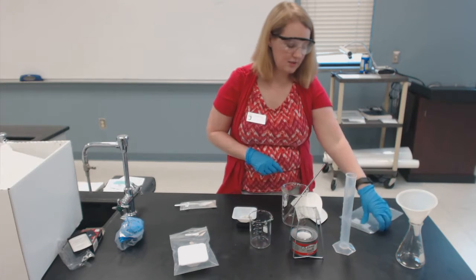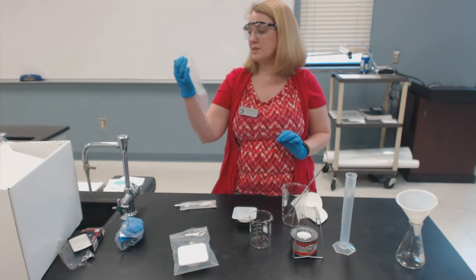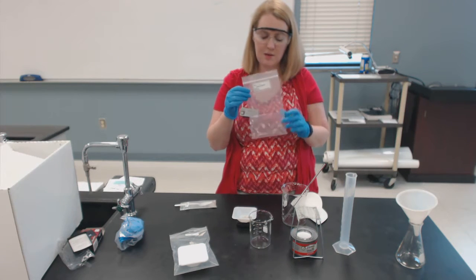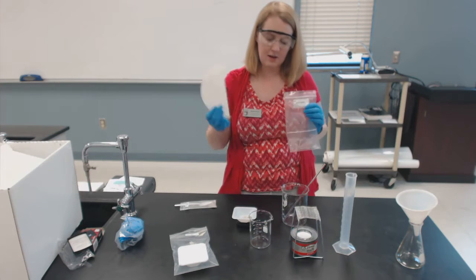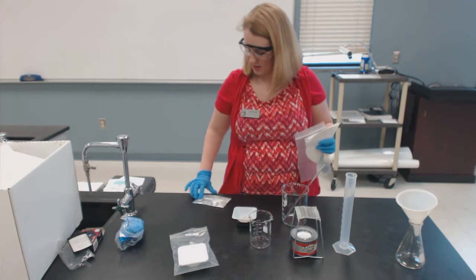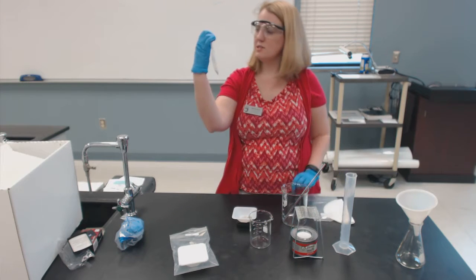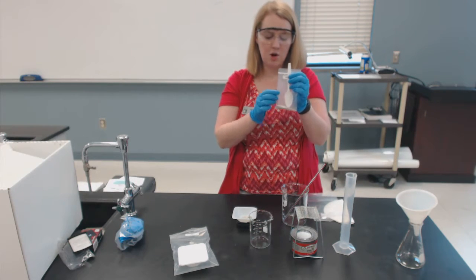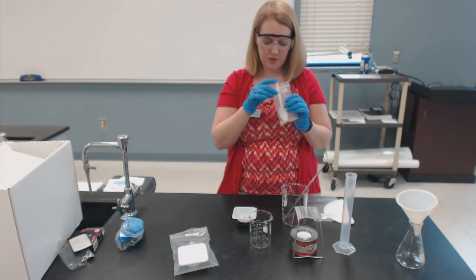So the first thing is in an envelope, it says types of matter. Now, of course, we're going to be using this to do a separation of a mixture lab, but inside of this envelope, you should have had filter paper and then a mystery sand and salt mixture, and it says must weigh amount because you're not going to be using all of it, and a scoop.